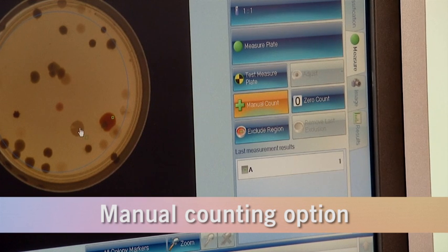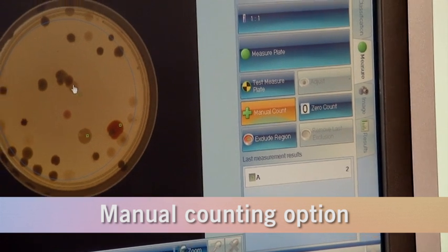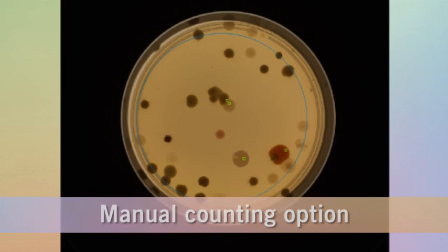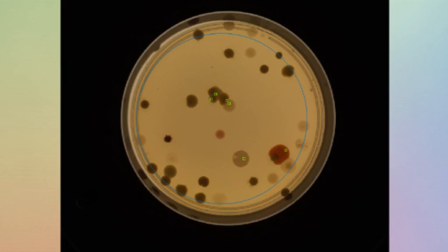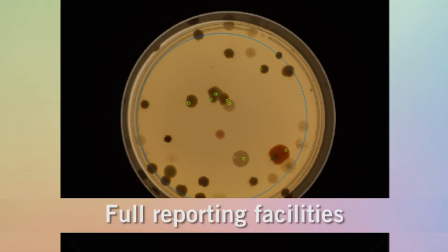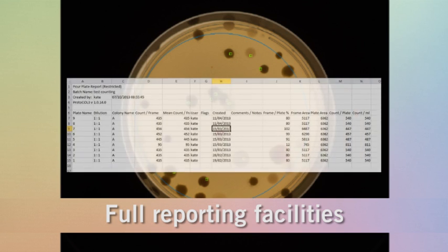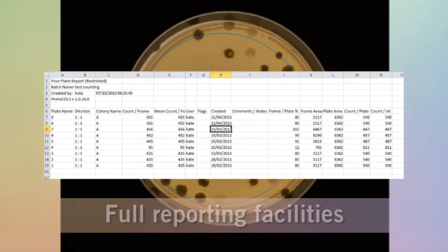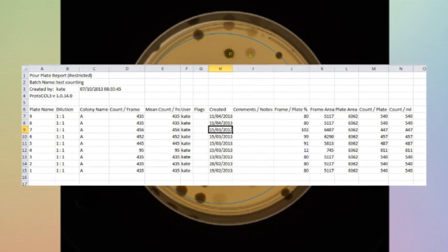Manual counting can be selected when preferred. Either way, full reporting is available with a complete audit trail in a protected Excel format.